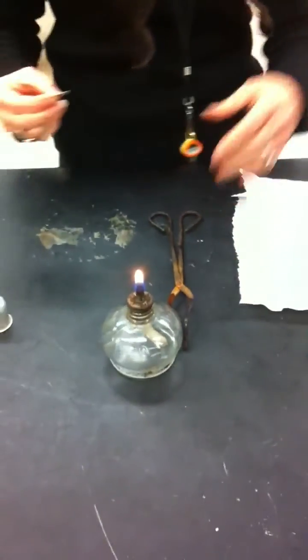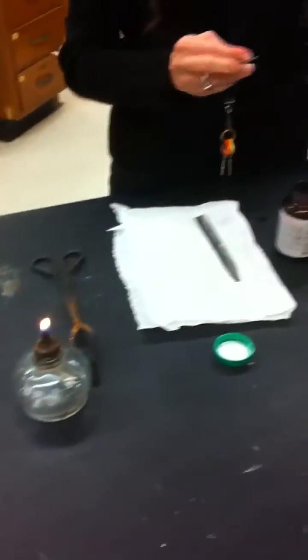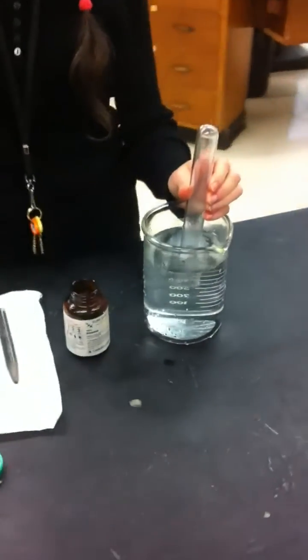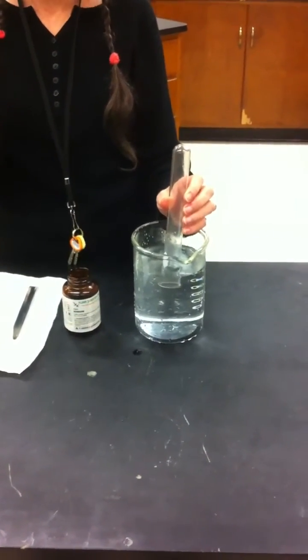All right, I got my fire. Thank you very much. In order to test for hydrogen, we put a flame under the test tube, and we ask ourselves, is this going to make a little pop, or is this going to make a big pop?